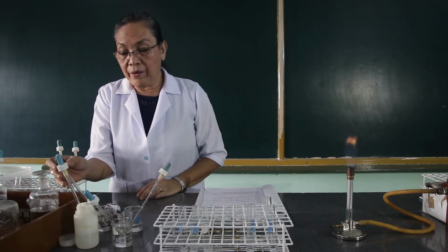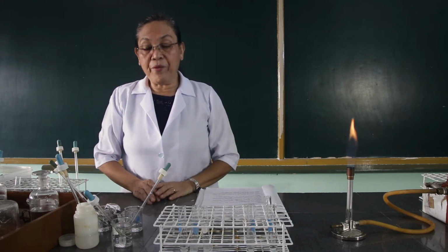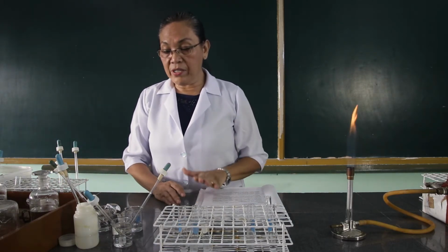Then we are going to mix the ammonium chloride, the ammonium hydroxide, the calcium chloride, and the ammonium carbonate.